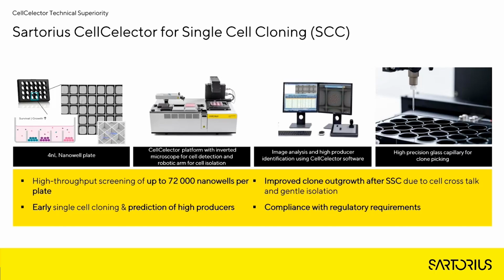Second, the device itself with the nanowell plate stage, the inverted microscope for bright field phase contrast and fluorescence imaging, and the precision robotic arm for cell isolation. Then the software for image analysis and high producer identification. And finally, the high precision glass capillary for clone picking.